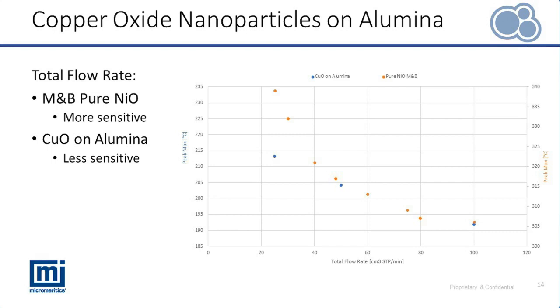The copper oxide performs closely to the expected models which he discussed. Other analysis conditions for Monti and Baiker were similar and only slightly different. They used 5% hydrogen, 12 C per minute heating rate, and 405 micromoles of nickel oxide.